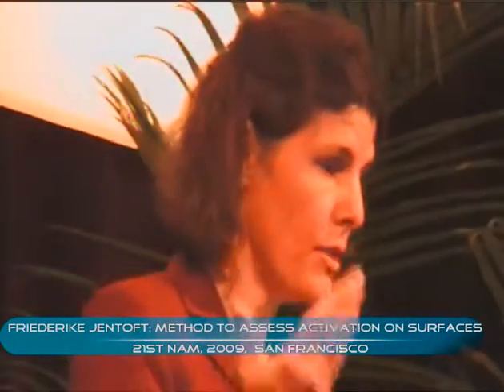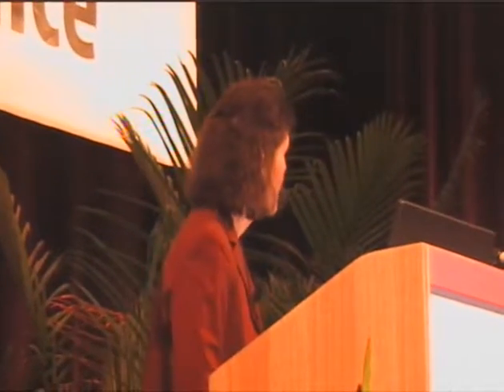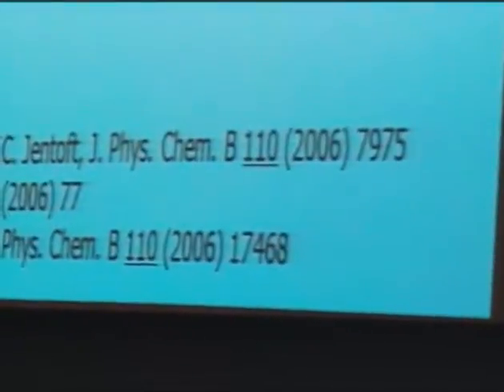Now, my main point why I'm showing this is that the majority of information that is extracted from infrared spectra is that one looks at the positions of bands and identifies species. And that's almost exclusively true, except for some applications in the determination of the number of acid sites. And of course, there's much more information in an infrared spectrum, because there aren't only band positions, there are also band intensities and band shapes. And what we are interested in is the band intensity, because if you look at the fundamentals of infrared spectroscopy, the intensity is actually a quite intriguing quantity.